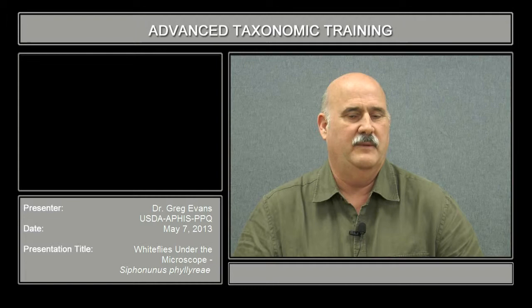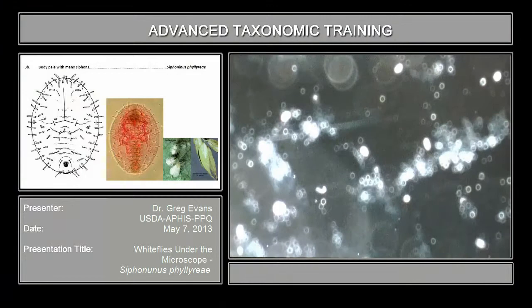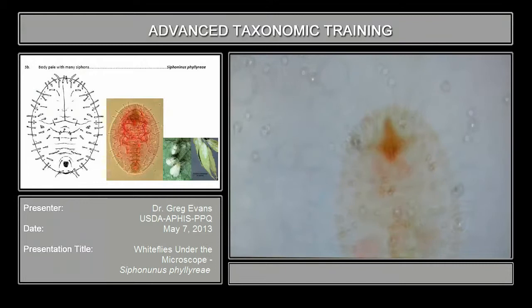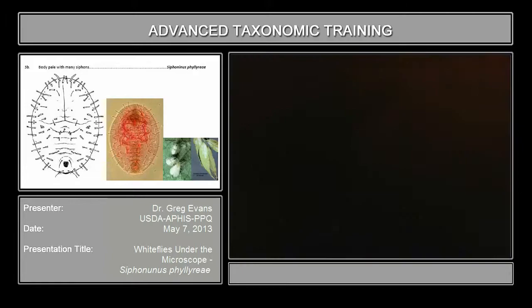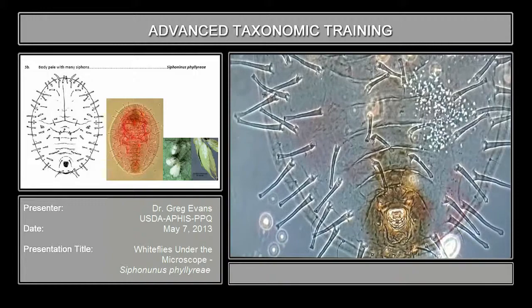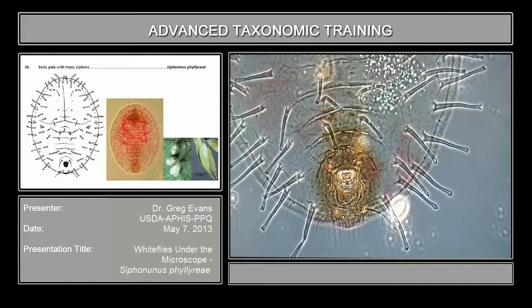We'll go to the Siphoninus phyllorea specimen next. This is the ash whitefly, and you can see that it has these very elongate siphons. It's pale in color, and it too has this very unusual character that's only found to this degree in Siphoninus. There are some other genera that have a few siphons, but nothing like this.